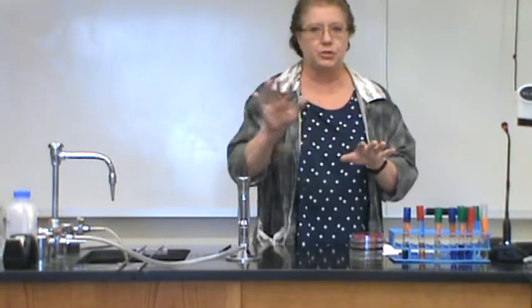You remember a couple weeks ago we learned that using streak plate technique you can take a mixed culture, such as something taken from a wound or a fecal sample, and isolate different colonies of each of those individual species of bacteria. That isolated colony is a pure culture of that bacteria, so you can use it to identify what kind of bacteria it is.